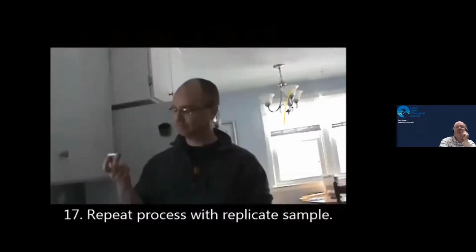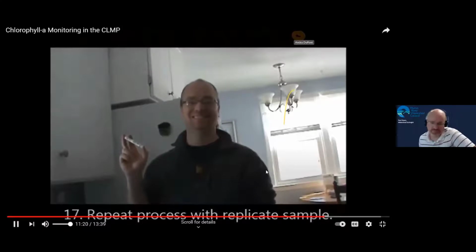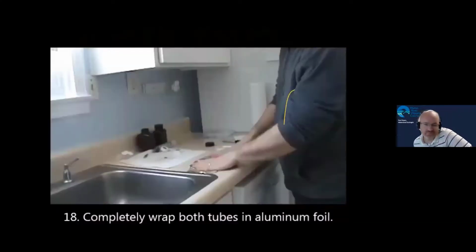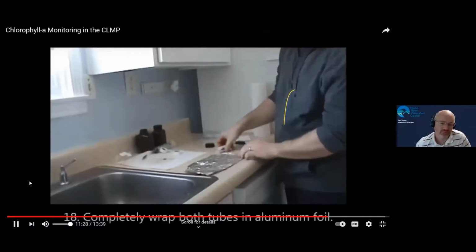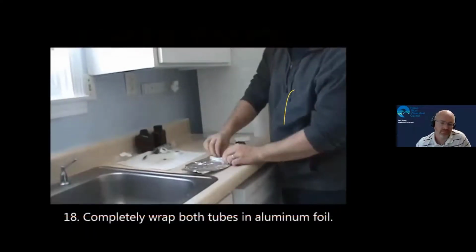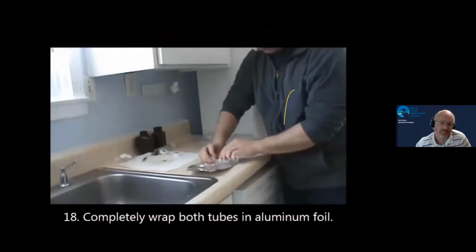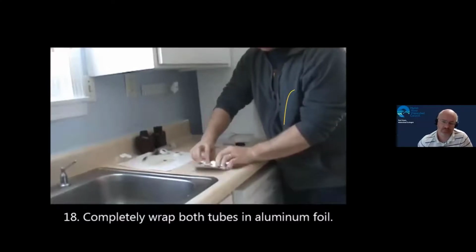You now have one sample complete. Congratulations! Now you get to do it all over again with your second sample bottle. Once both samples are complete, wrap the vials completely with aluminum foil to keep all light out. This foil wrapping step is critical. Unwrapped samples cannot be accepted for laboratory analysis.